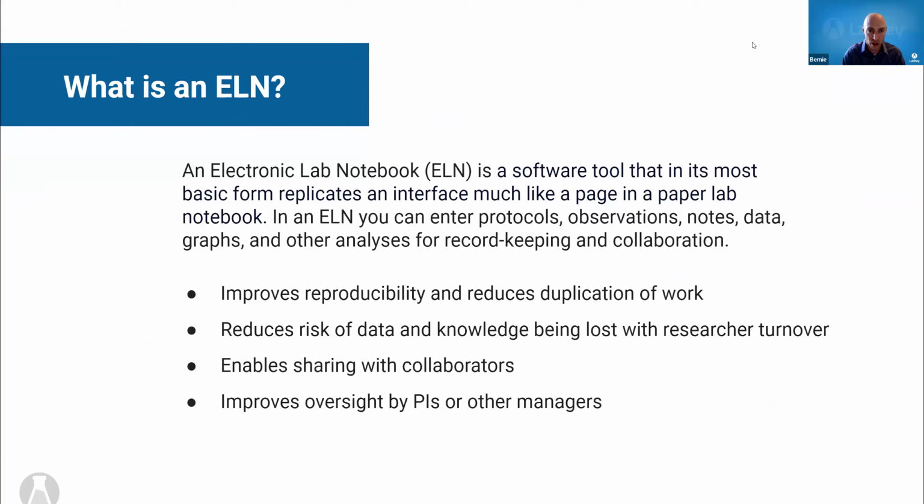Let's get on the same page to start with. I definitely like to line up definitions a little bit, and it's worth doing with electronic laboratory notebooks, which I'm going to mostly just refer to as ELNs from here on out. It's kind of a mouthful otherwise, but an ELN comes in a variety of forms.